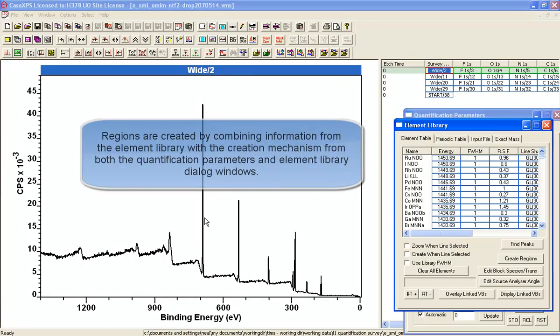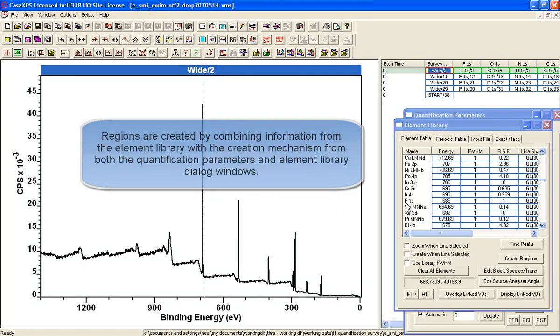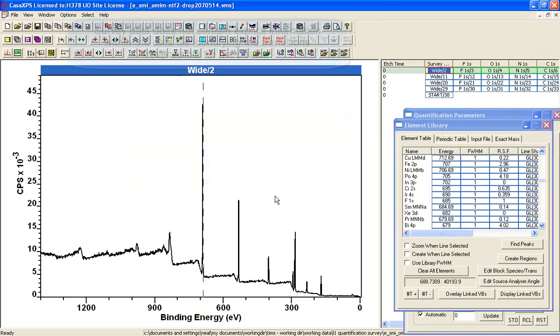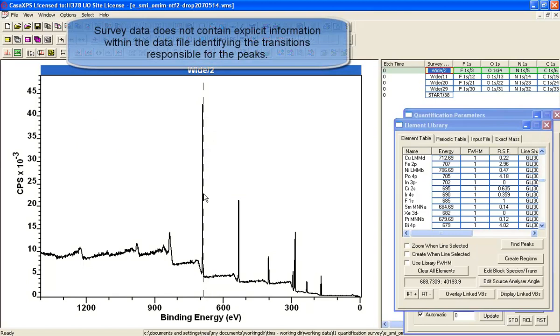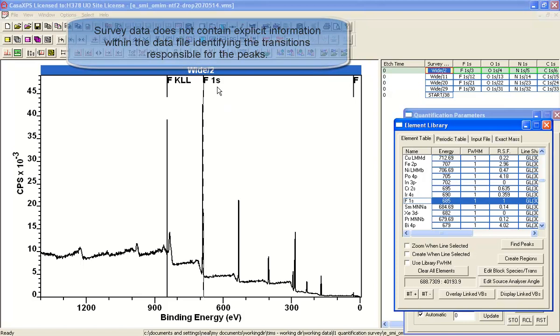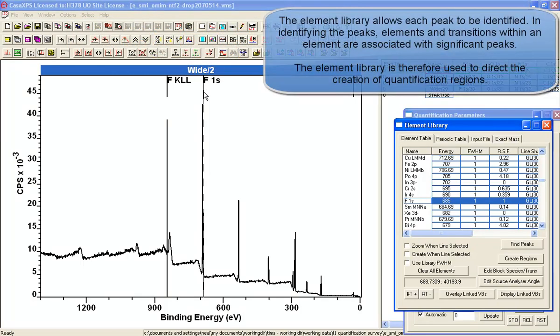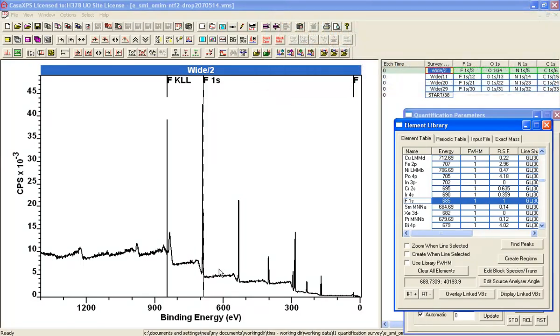The first thing we need to do is identify the peaks that we see here. So I've clicked on the peak, the largest peak, and it's most likely going to be Fluorine 1S. I can now see that I've put up markers that correspond to the Fluorine 1S as an Auger peak that matches it, so that's probably Fluorine.